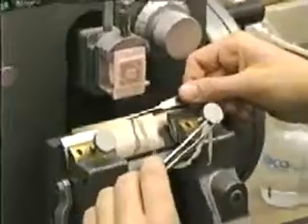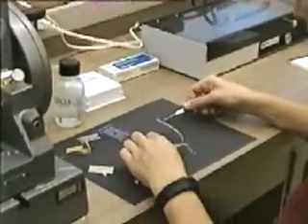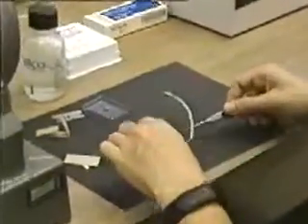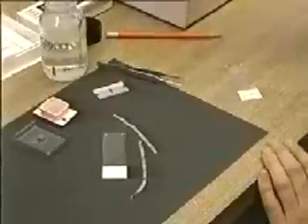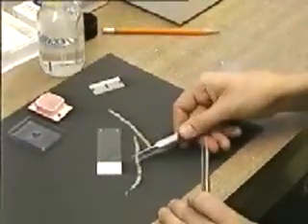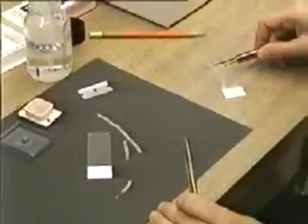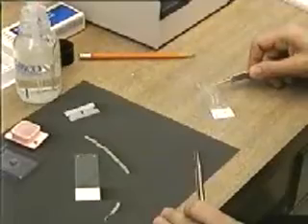The individual sections stick to one another and comprise a ribbon of paraffin sections, each with a slice of the specimen. Using fine tipped forceps, the operator removes a ribbon of sections and cuts them on a clean surface. A clean glass microscope slide treated with an adhesive is flooded with a dilute formalin solution on which segments of the paraffin ribbon are floated.